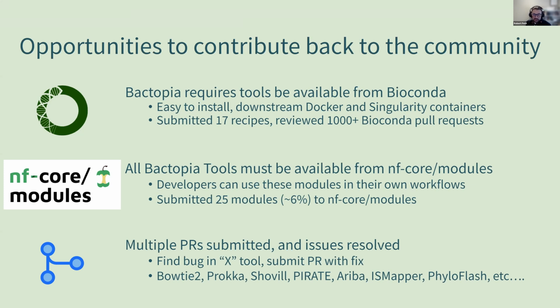Also, as I find things have stopped working in Bactopia, it may be a simple hard-coded HTML link change in a program, and we could just submit a quick pull request to that tool. Because of breaks that I've found in Bactopia, I've helped resolve issues downstream in tools including Bowtie, Prokka, Shovill, and Pirate. I like this idea that I'm not just consuming what's out there, I'm helping to give back.